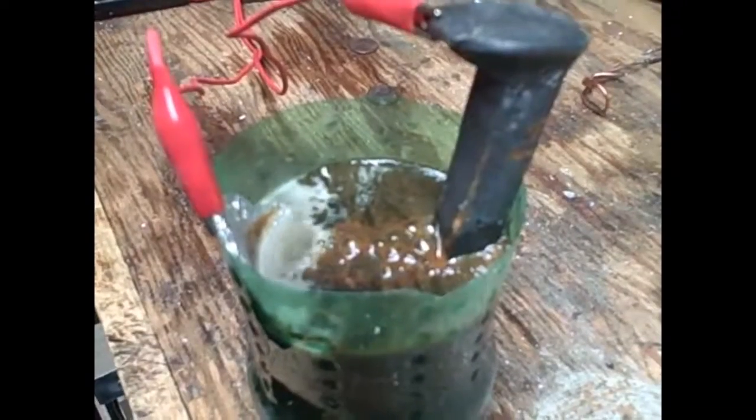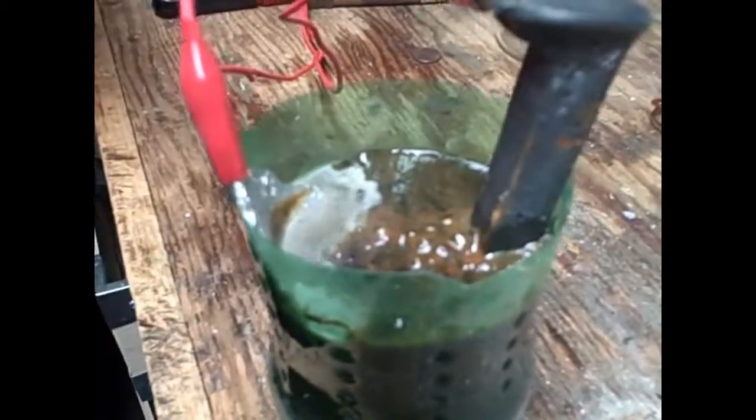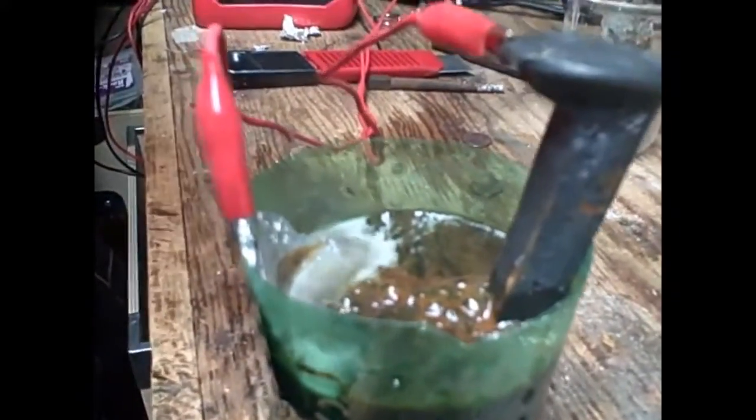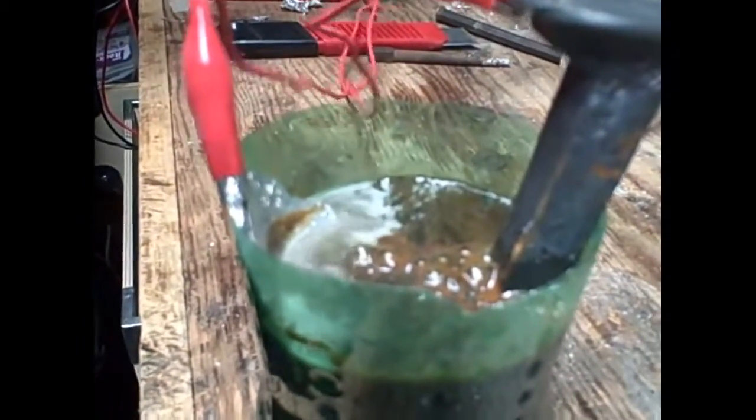It smells very strongly of chlorine. Is this safe? I don't know — in the basement? We're about to turn off the electrolysis and you should definitely be turning it off now because of the fumes. As you can see, there are fumes and vapors coming off. Smells bad. We don't want that, so we're going to unplug it.